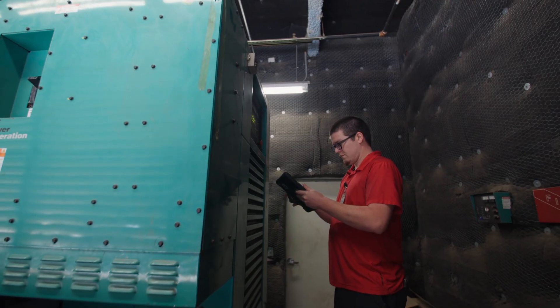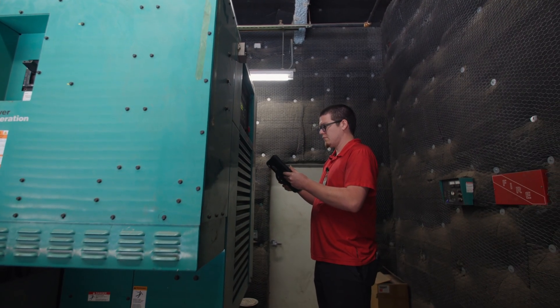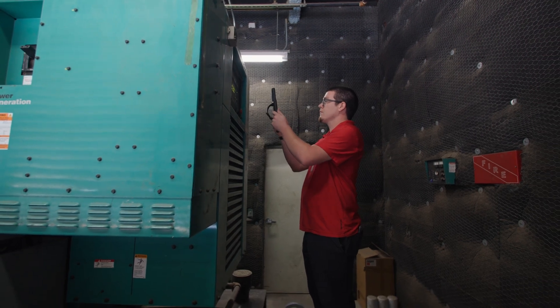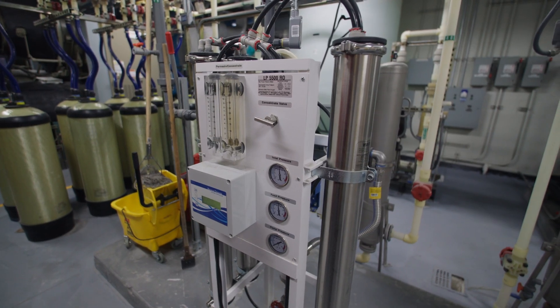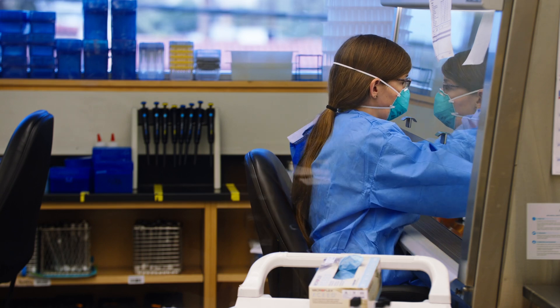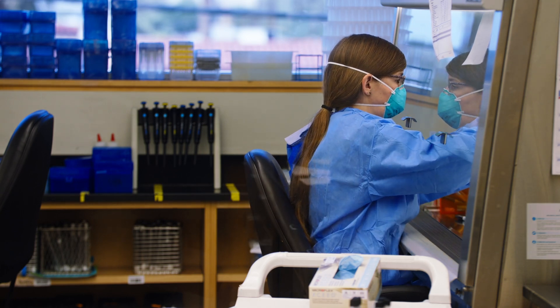All three power supplies have never failed at once, but if they did, this room would automatically shut the air supply valve to keep negative pressure for as long as it takes for Bailey to exit safely and seal the room behind her.